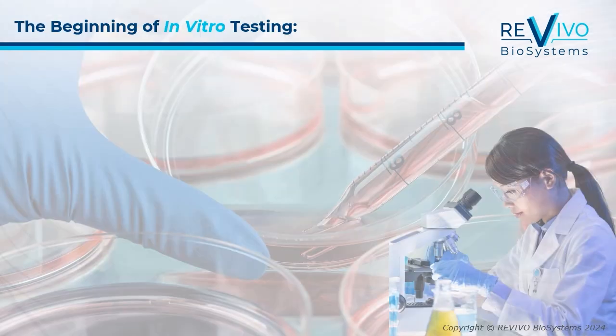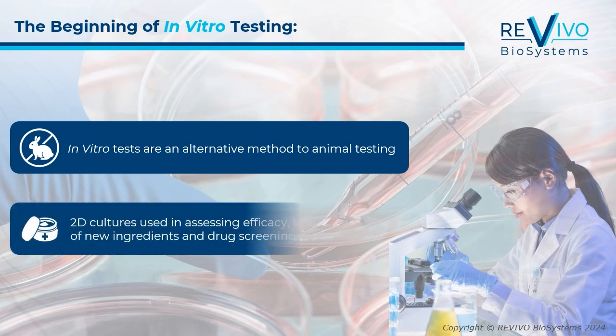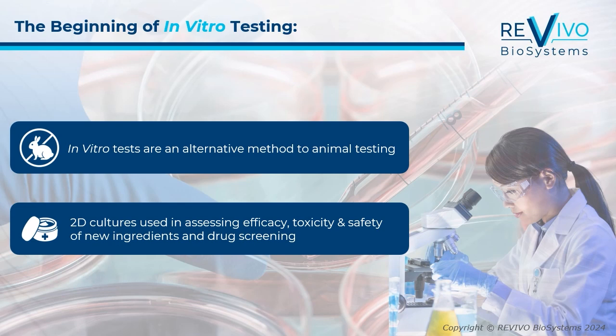So let's start off with the beginning of in vitro testing. In vitro tests play a pivotal role in scientific research and product development by providing a controlled and reproducible environment outside of the human body. In vitro tests represent an alternative method to animal testing of pharma and cosmetic ingredients and products. For decades, researchers have relied on traditional in vitro 2D cell cultures to understand cellular behavior and drug responses. 2D in vitro tests are essential in investigating biological processes and understanding the underlying biological mechanisms involved in diseases and treatments. As such, they are used in assessing efficacy, toxicity, and safety of new cosmetic ingredients and screening of drugs.